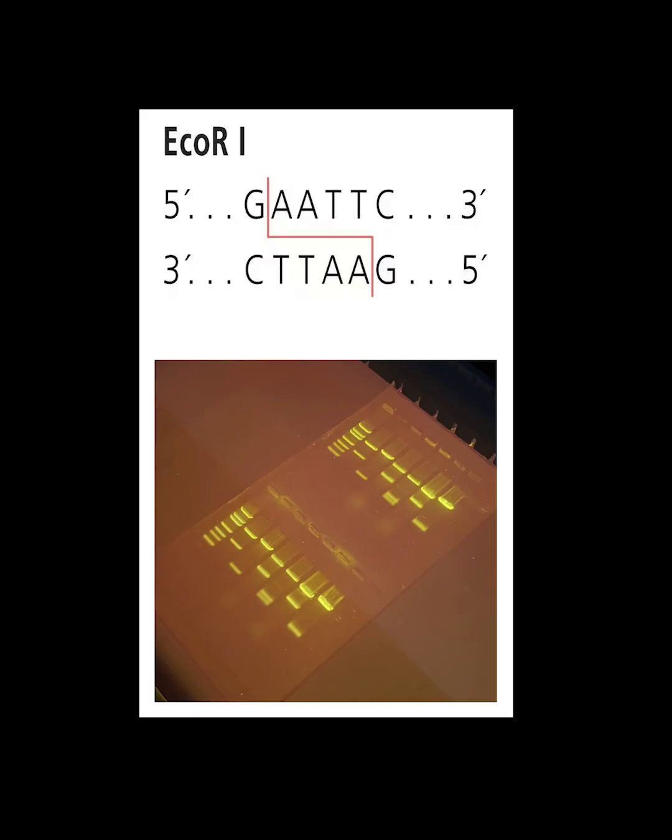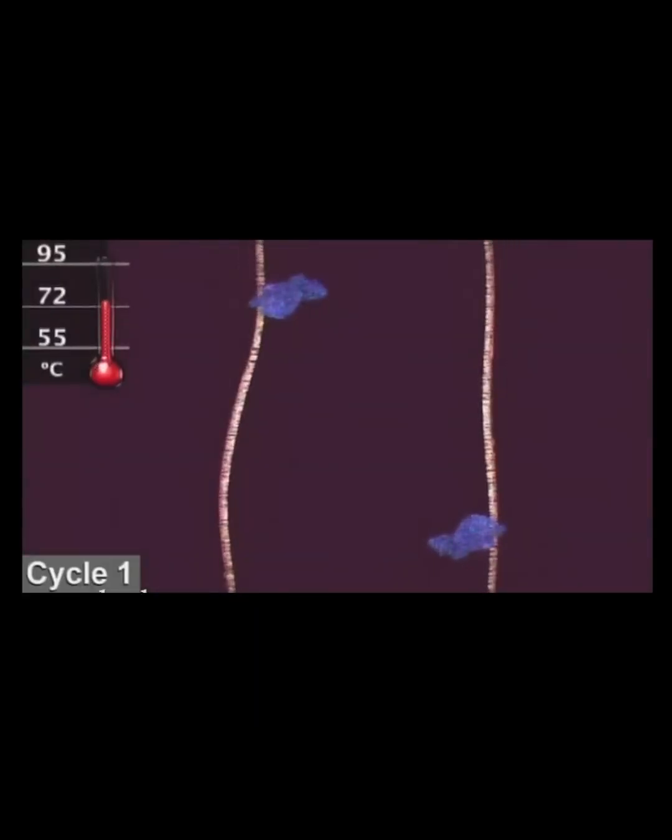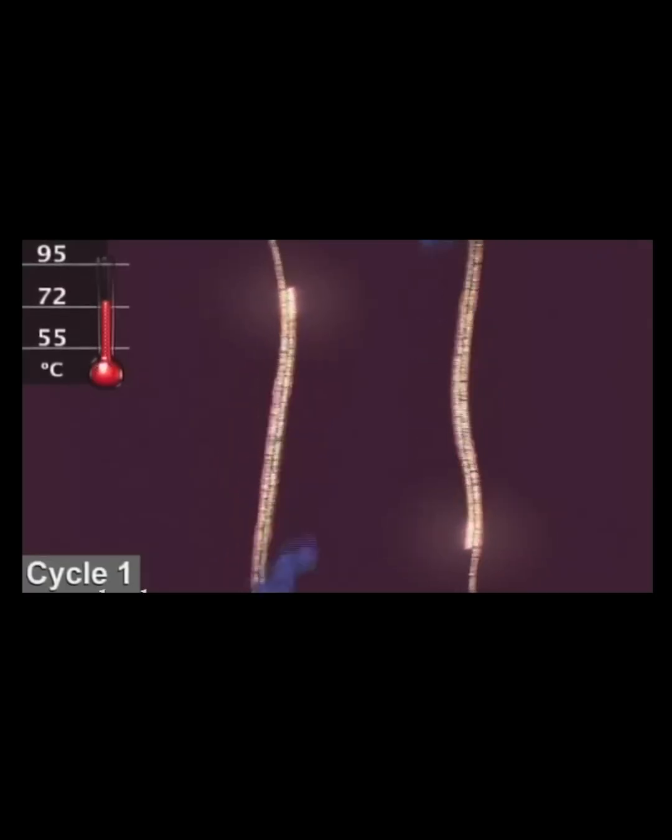Before lab, Dr. Hartman PCR amplified the mutant gene directly from the CDCX strain. Taq polymerase adds an extra adenine nucleotide to the 3' end of PCR products. This creates an A overhang.